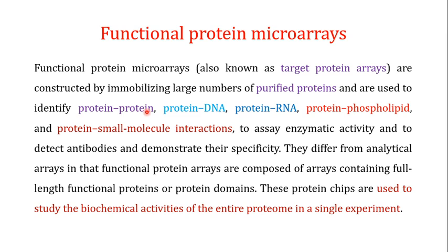identify protein-protein, protein-DNA, protein-RNA, protein-phospholipid, and protein-small molecule interactions. So here you are focusing on the functional aspect of the protein. In the analytical microarray, you are focusing on the differential expression, or the presence or absence, of a particular protein under different conditions.